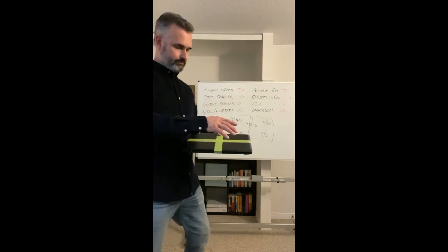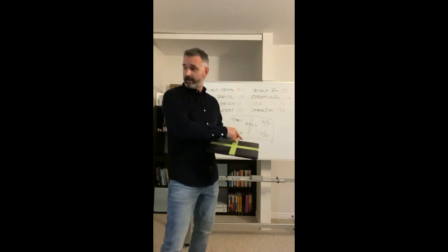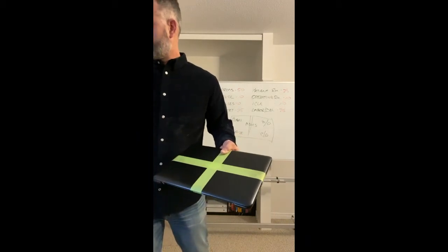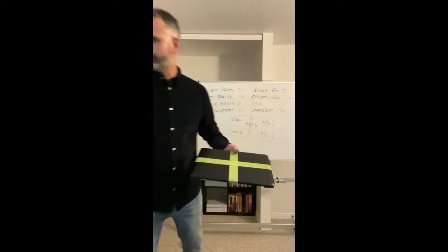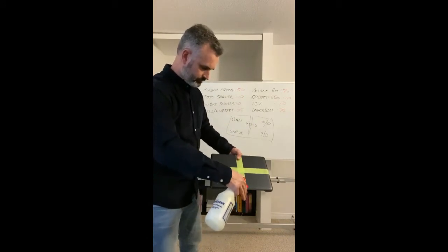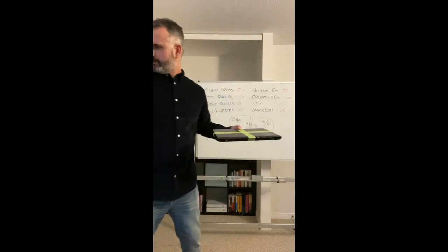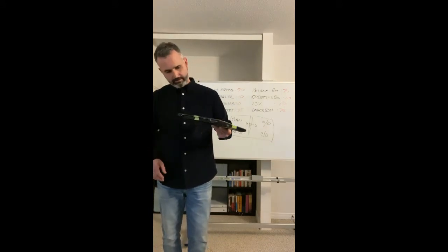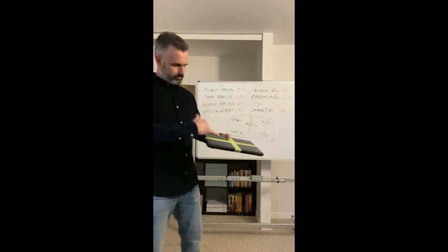So we're gonna apply disinfectant. So this is the area that's been cleaned. This is going to be disinfect only. So I want to cover this without actually touching the, here's what we'll do. So I'll try and keep this on the one side here. So what we'll do, we're going to let that sit for a couple minutes. And you can see a little bit got on this one. So when we swab this, we'll keep it over to this section here. So we'll let this sit for a couple minutes.